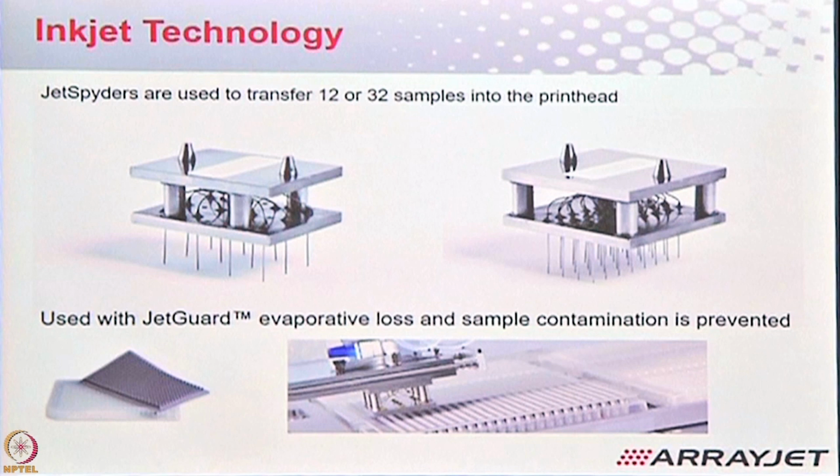The way we calculate the efficiency is 640 features per second. That is super quick. Sometimes you don't even know whether your sample is printed or it's ongoing because it's that quick when it moves.